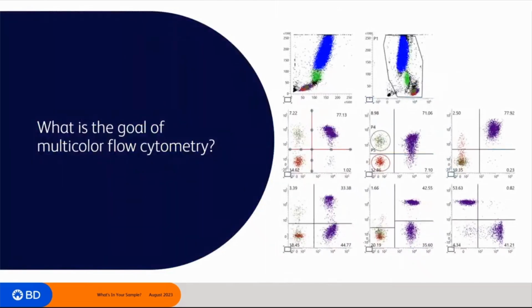Again, our goal for a flow cytometry assay is to get distinct cell populations so we can gate them. In this case, we do gate on 2 populations that are relatively easy to gate because one cell population expresses that marker and the other one doesn't. But what do you do when the positive population is dim? Like for example, here, what do I even mean when I say dim? How do we measure this dimness or brightness? How do we measure the resolution?